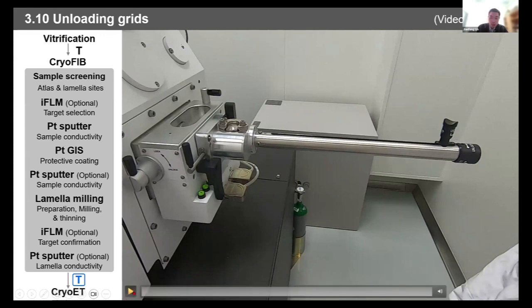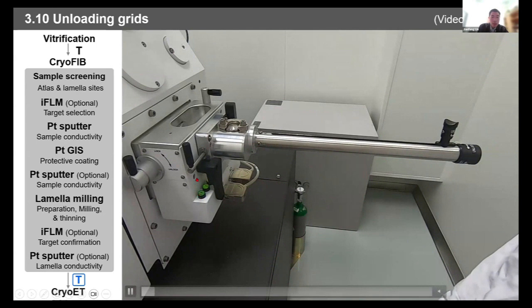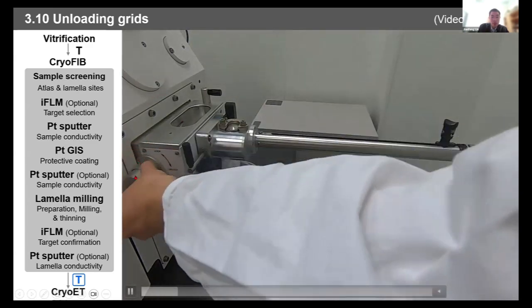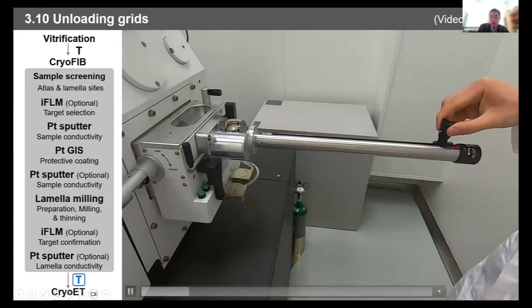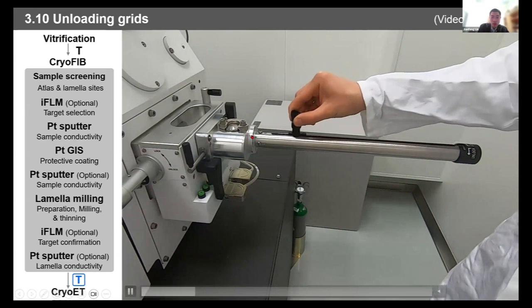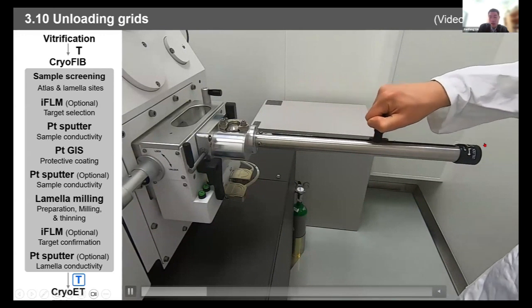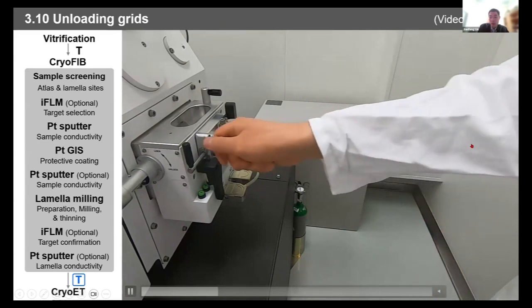I will press the movie, and then you can see. So you first press the P button. It will move the sample to the location where it is ready for you to pick up, and also pump the air lock. After pumping, you are ready to open a valve and release the transfer rod, slide in, pick up your shuttle, lock it and retract it. And secure it, because the vacuum will drag the load back, so you need to secure it.